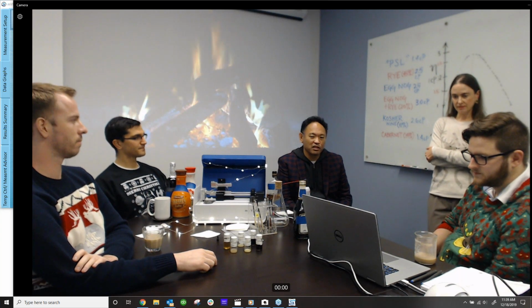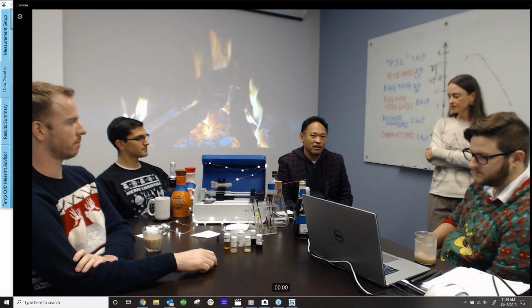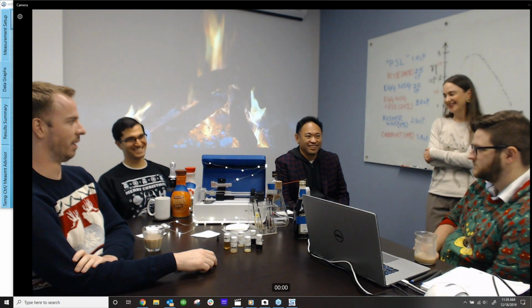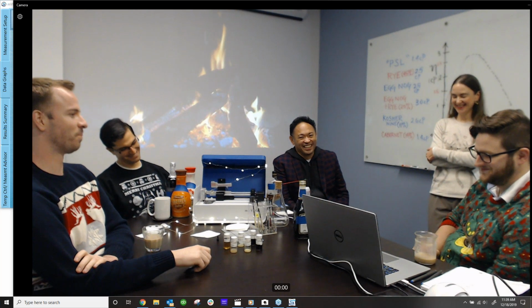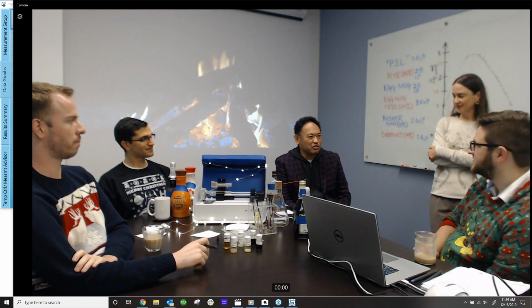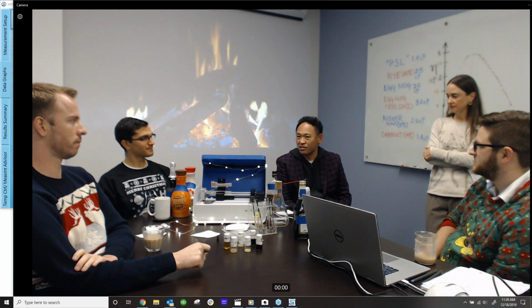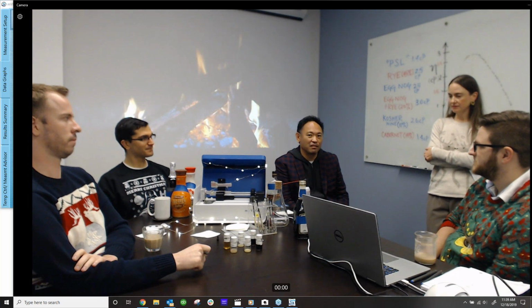Yeah, we've actually tested viscosities in the hundreds of thousands. For example, I think we've gone up to about 300,000 centipoise, which is 30 times the viscosity of honey. So we can get very high on viscosities.